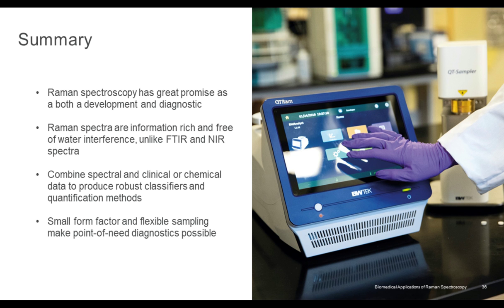So to summarize, we think we've shown where a number of Raman systems can be used to produce information that is relevant for development of diagnostic tools and even, and again, monitoring tools. And the big strength of Raman spectroscopy in this space is that the spectra are information rich.